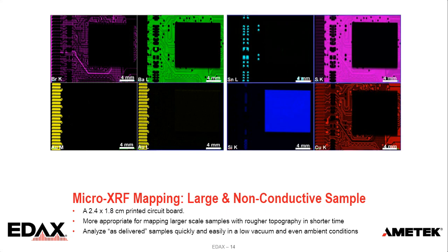This is another PCB, 2.4 by 1.8 centimeters, a relatively large, non-conductive sample. We see different energy lines, and some of them are pretty high energies. I added both gold L lines and M lines, in the bottom left corner. I added both lines because they have different escape depths, so you get different information from using both.